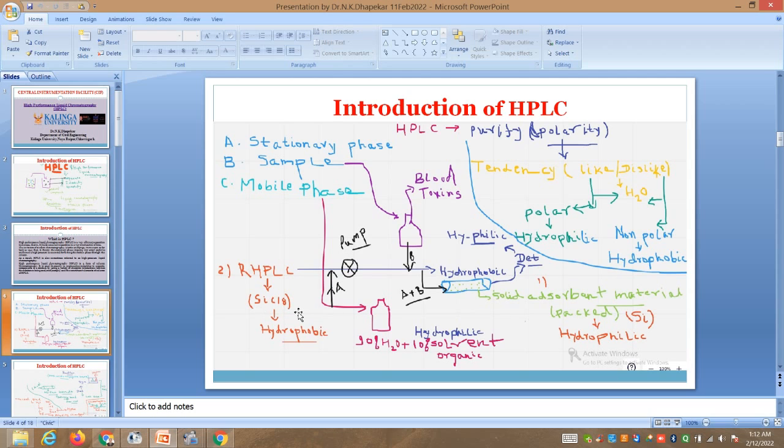And when carbon C18 is used along with silica, reverse HPLC, we can work, and nowadays mostly researchers are working on reverse HPLC. So if the mobile phase, which comprises 10% organic solvent and 90% water, is pumped along with the sample, may be a blood sample, biochemistry, or in chemistry toxins. In civil engineering, samples may be admixtures, superplasticizers, cement added with water.